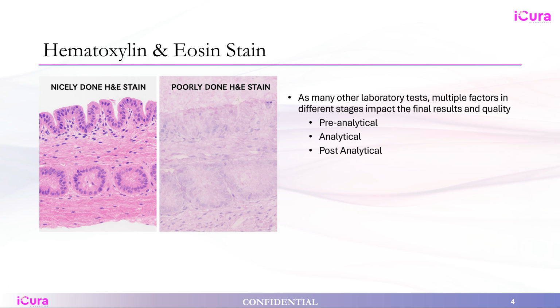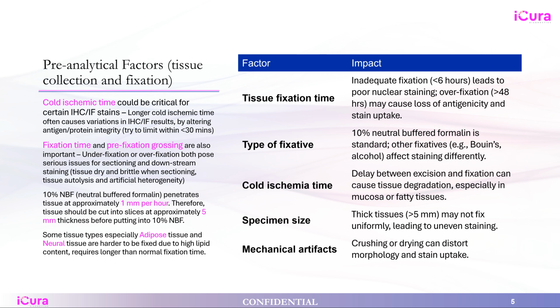As with many other laboratory tests, multiple factors in different stages or phases impact the final results and quality. We divide them into pre-analytical phase, analytical, and post-analytical phase. In the pre-analytical phase, factors impacting histopathology assay quality include some of the important ones listed here.